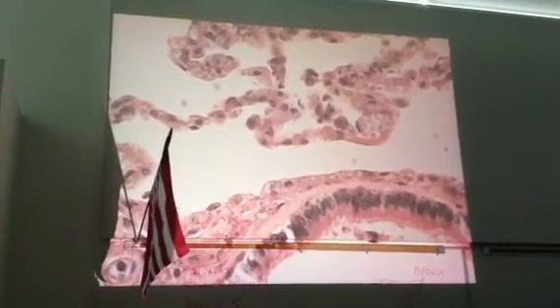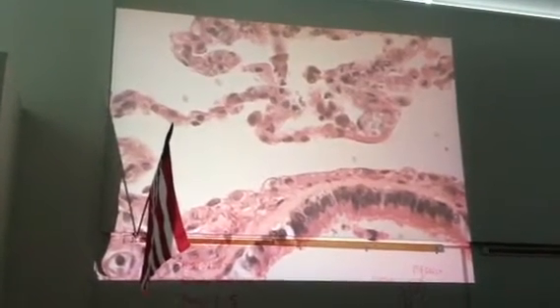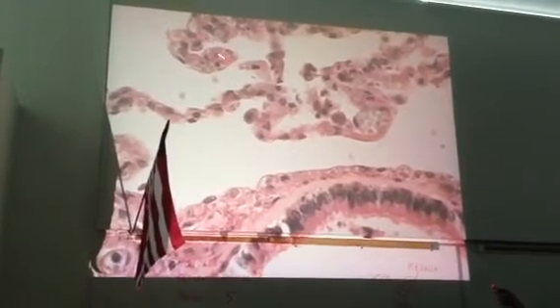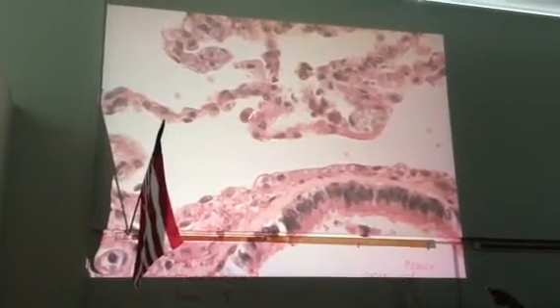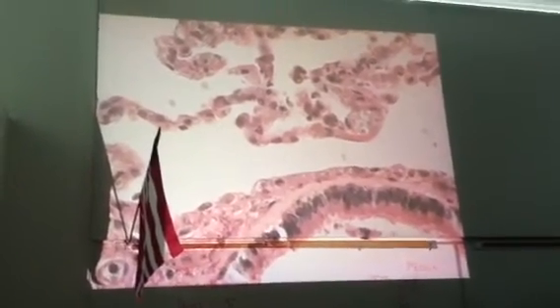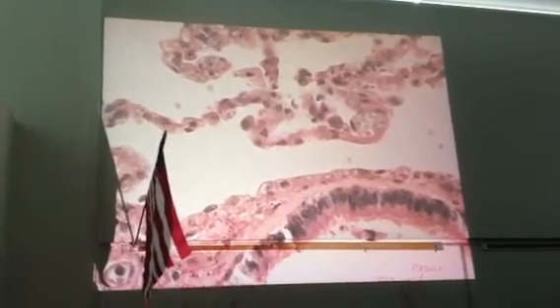And actually, I'll leave the slide out so if anybody wants to look at it, because when it goes through this projector, you kind of lose the coloration of green, although I can see it up here in these. But each one of these, this is like an alveolus, and on the other side, here's one right here. So 350 million air sacs we have in our lungs, so they're everywhere. But they just collapse because there's nothing to keep them inflated once the section is made.